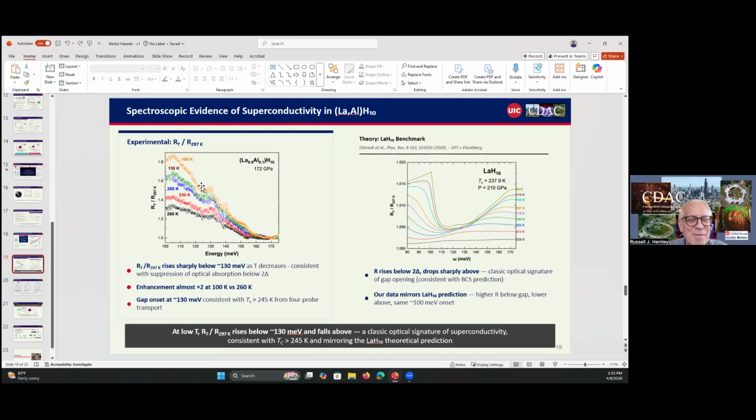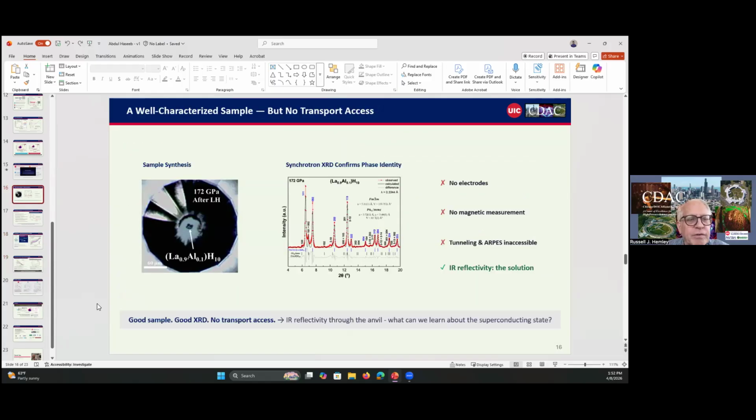So great comment. Abdul, why don't you go back to your picture of the sample, because it's quite clear that you have a diffraction limit there. So that sample size defines your diffraction limit. Yes. It's on the order of 20 microns or something like that, right? Yeah, it's like 20, 21. So this is not an ideal sample for IR reflectivity, but it was one that was available. So we're continuing to work on this.